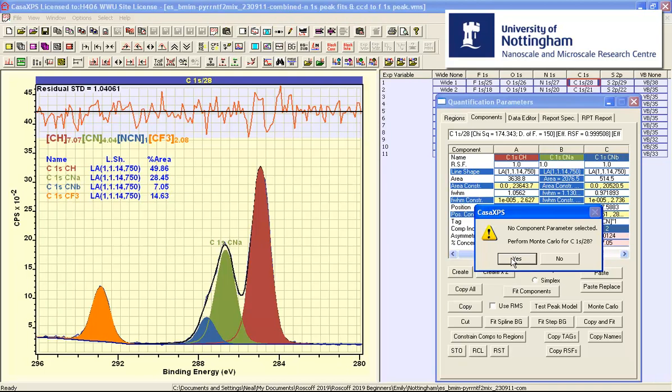And this may take a while and after a minute it will confirm whether you wish to continue or not. But in this case it is going to terminate well within a minute so I am going to press yes.